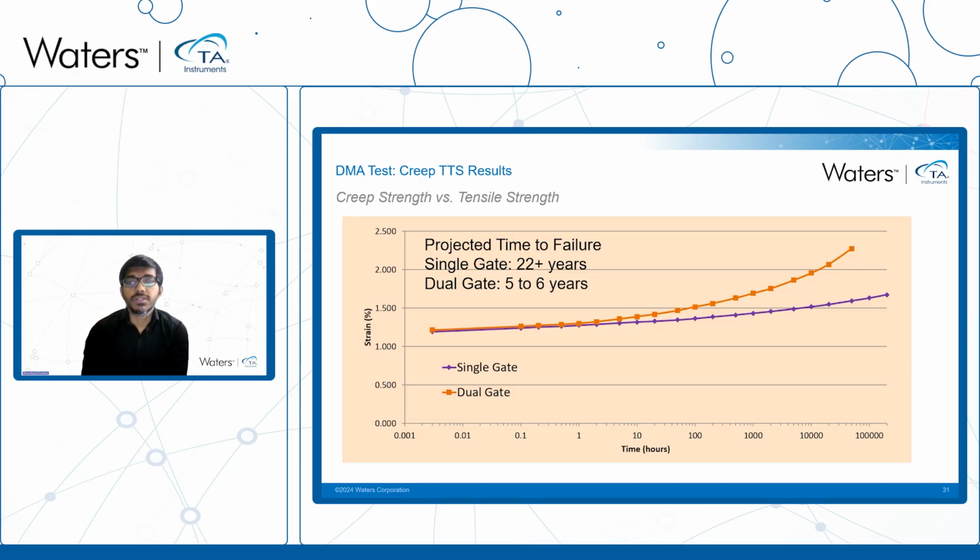Further, predictions or projections were made for effective creep lifetime for the PPE plus HIPS material under a stress of 25 megapascal, which is well below the yield point of the material. This plot is actually directly indicating the creep rupture or fracture of the material. When there was no knit line, represented by this blue curve here, the projected material life exceeds 22 years compared to 5 to 6 years with the material with knit line, represented by the orange curve.